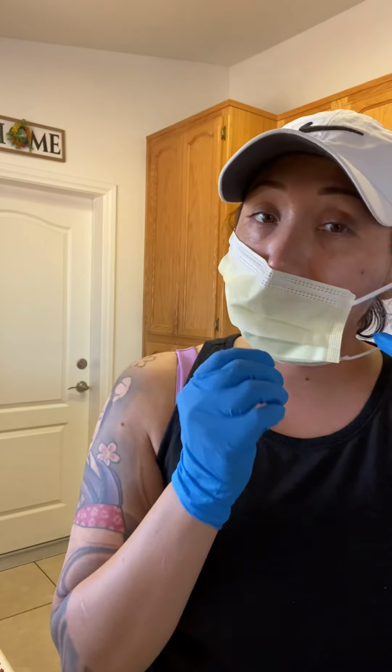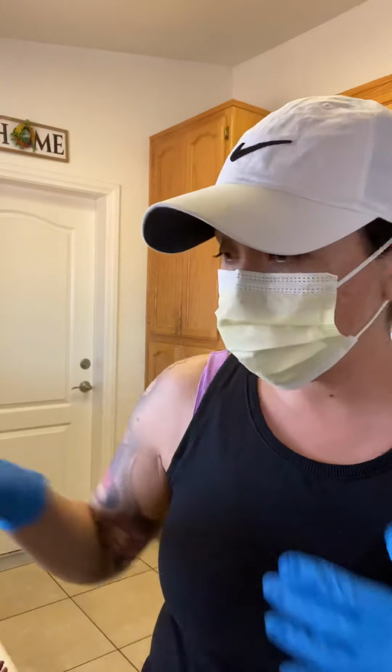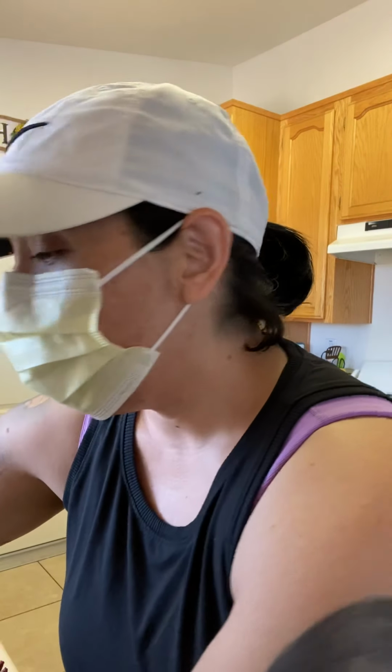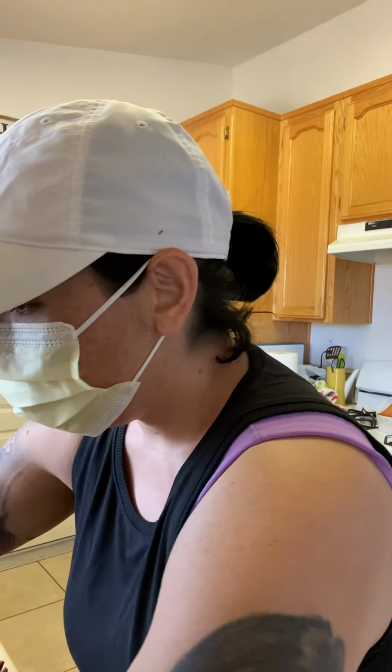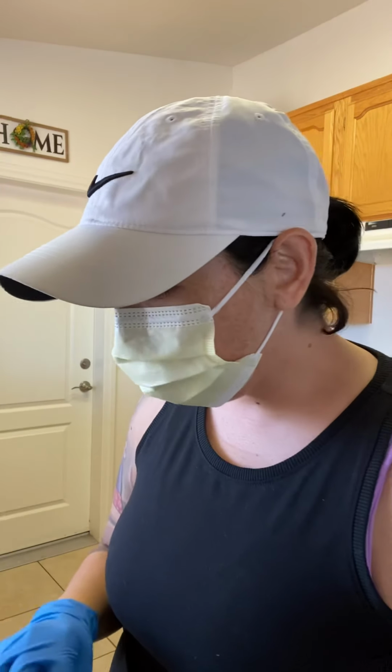I'm going to put on my gloves. Well, I already put on my gloves, and my facial mask. I'm not going to put on my goggles, because I already used my goggles for the dissection, because my pig was very juicy. And actually I already took off my apron because I made a big mess. So now that I have my pig here, I'm going to go ahead and take my phone and show you guys the job that I did.